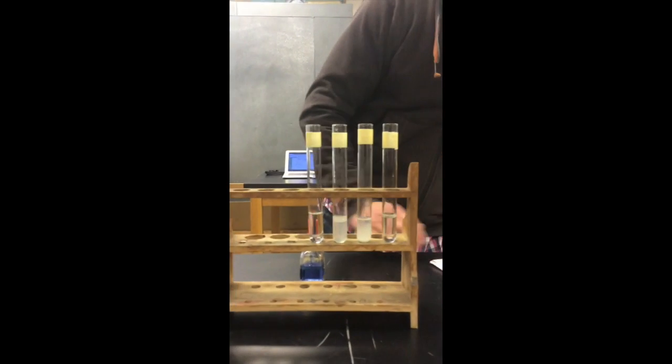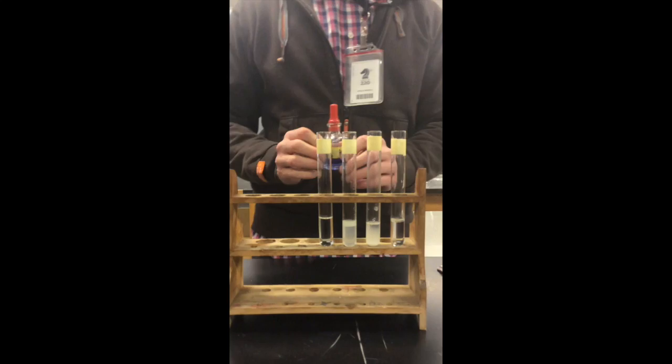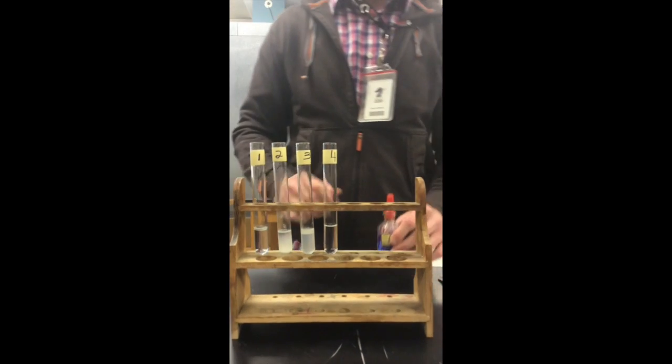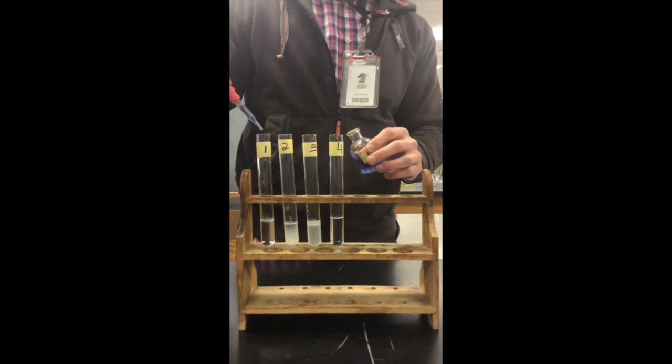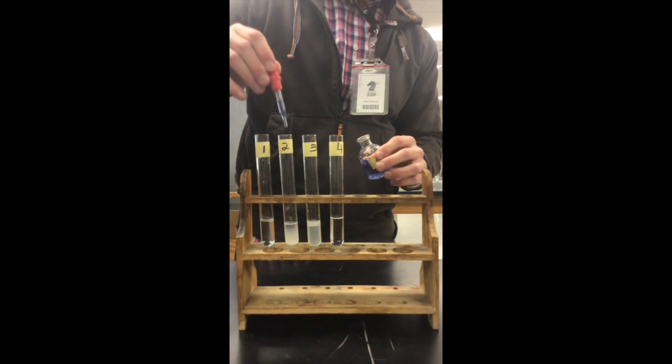Test number 4 is the Biuret test, and this tests for the presence of proteins. I'm going to go ahead and show that our test tubes are labeled with our unknowns. And I'm going to go ahead and add in our Biuret indicator. So again, this will show a color change if proteins are present.